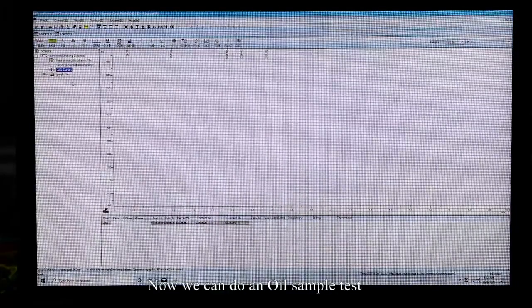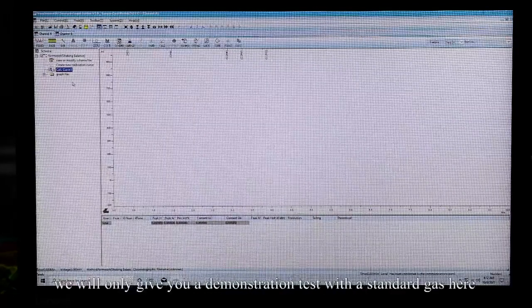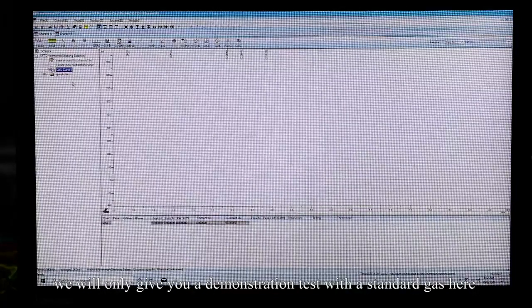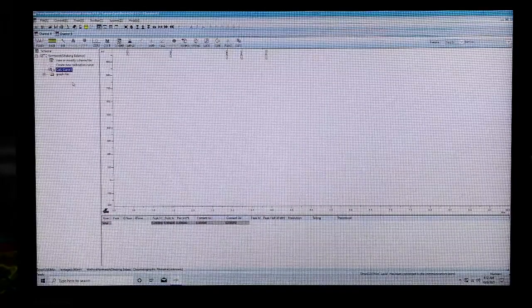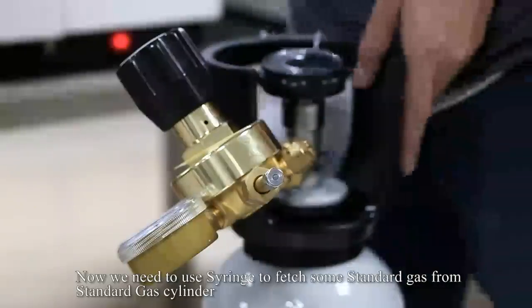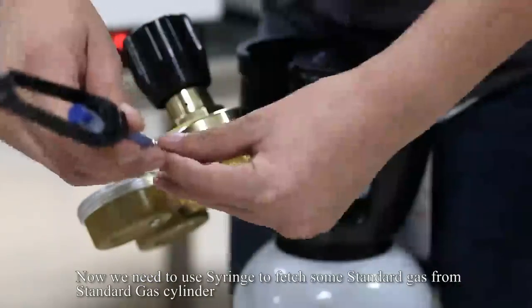Now we can do an oil sample test. Since we don't have a suitable oil sample now, we will only give you a demonstration test with standard gas here. Now, firstly take a standard gas. We need to use a syringe to fetch some standard gas from the standard gas cylinder.